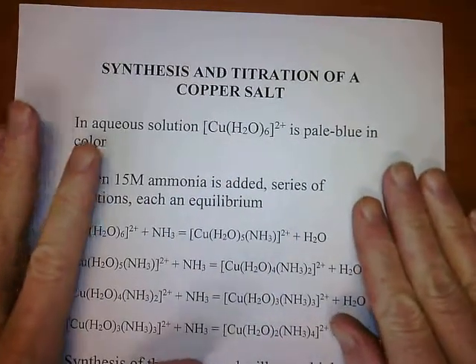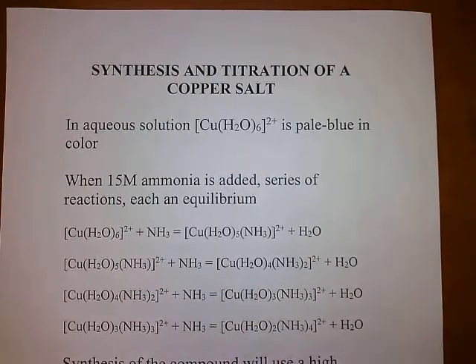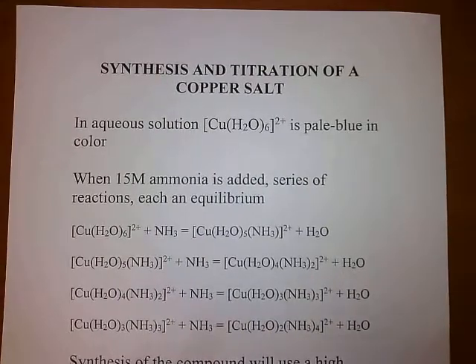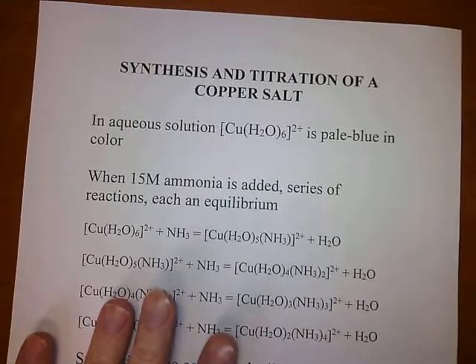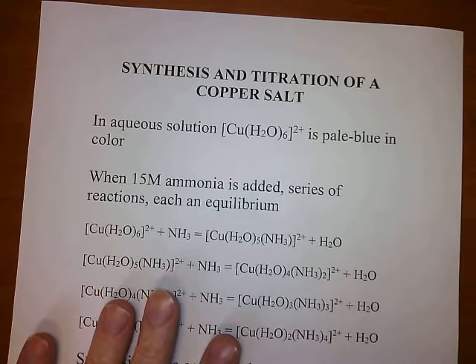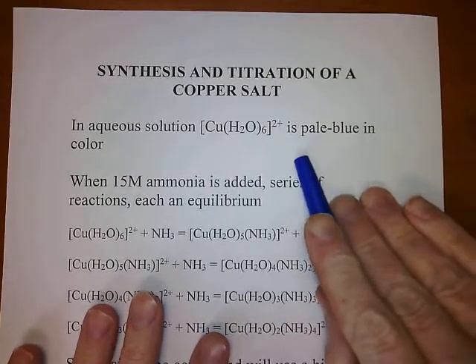So in this lab, we are going to do synthesis and titration of a copper salt. We're going to make a compound between copper and ammonia and then titrate it with HCl to determine how much ammonia was in the compound. So let's start with some background information.